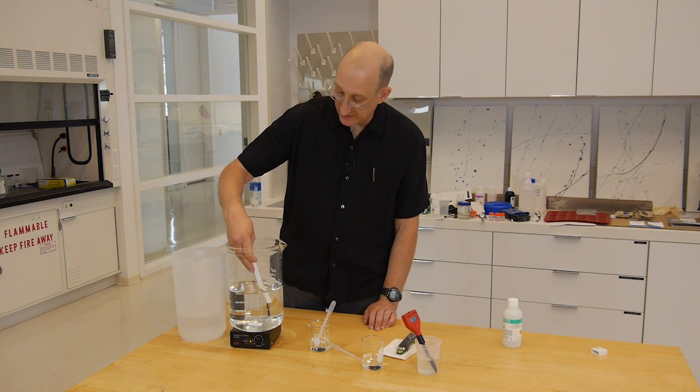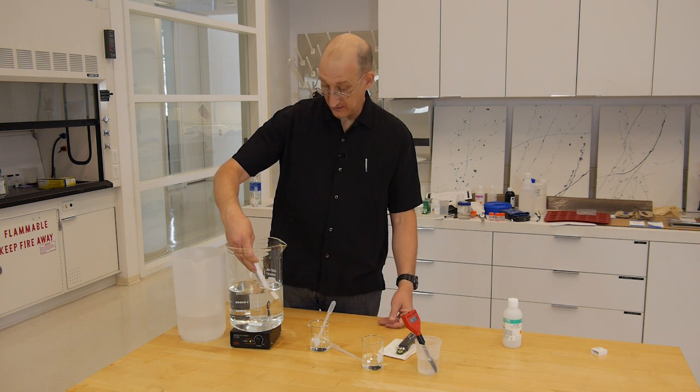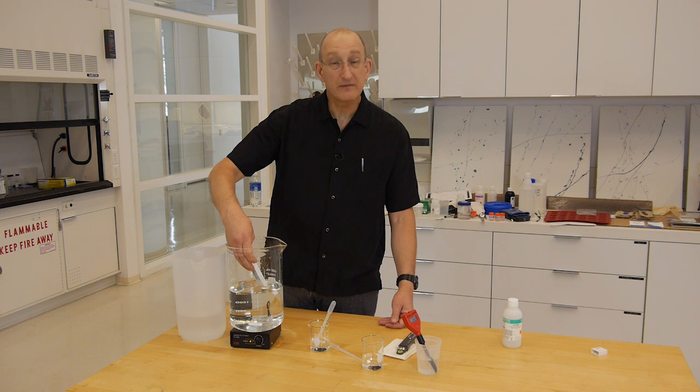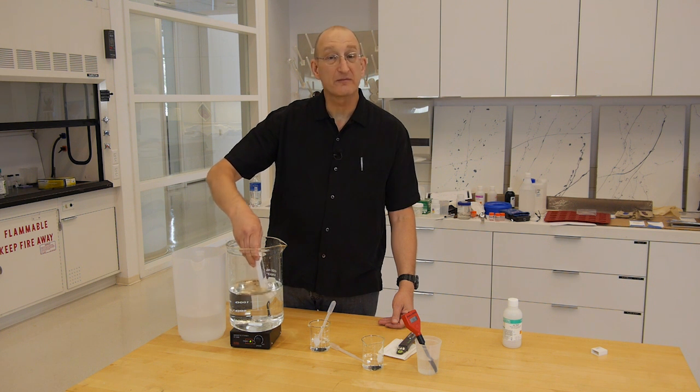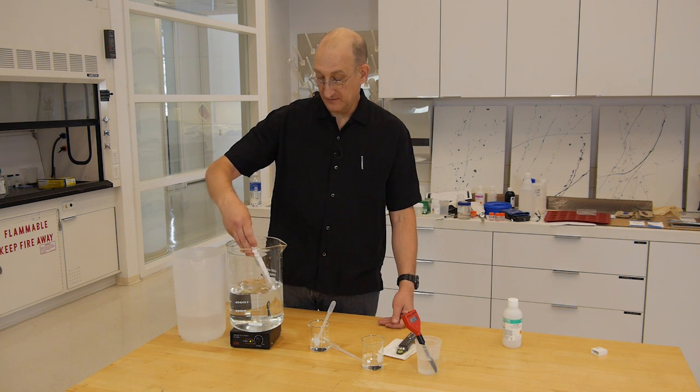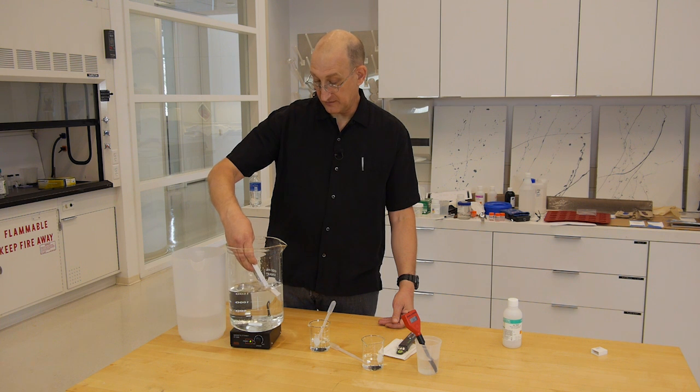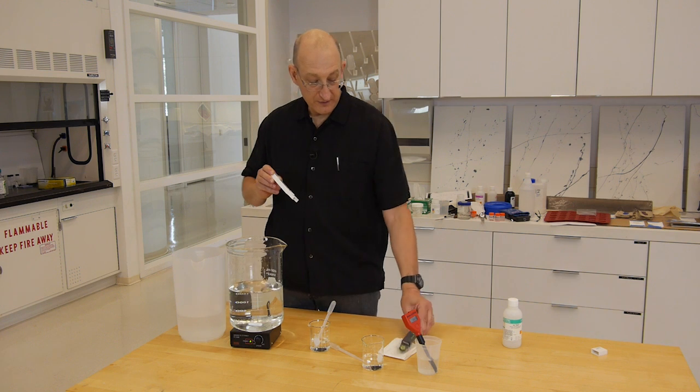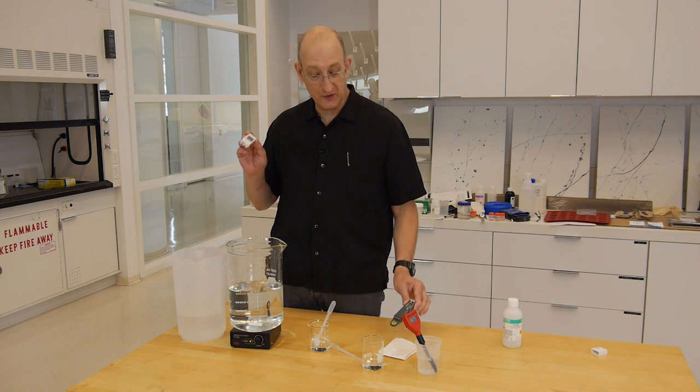And same idea, we put that in, we calibrate, and we get a reading in this case of 5.8, 5,800 microsiemens, which is again close enough to what we got with the other meter. This meter is probably better. This is a whole lot cheaper.